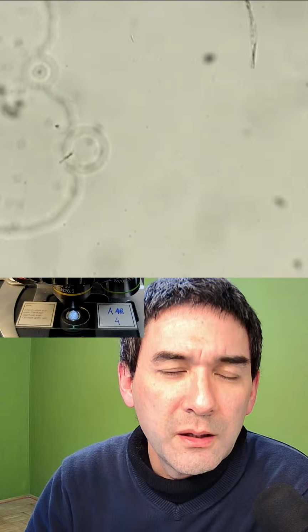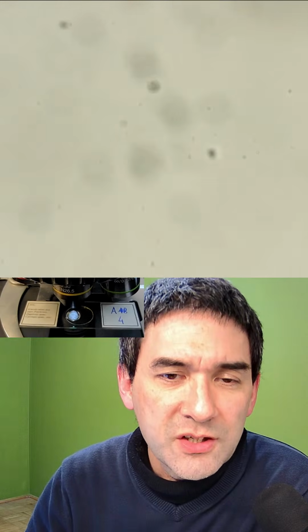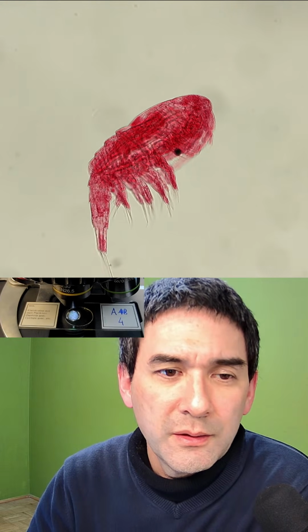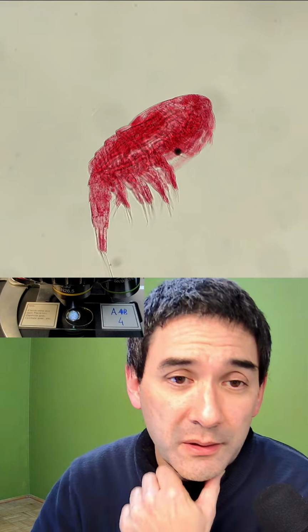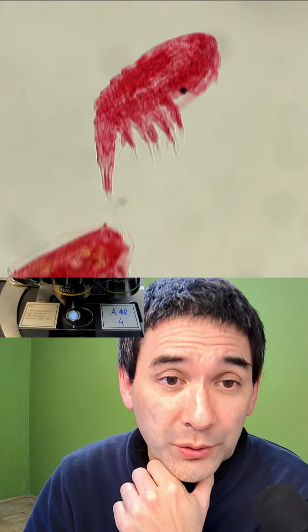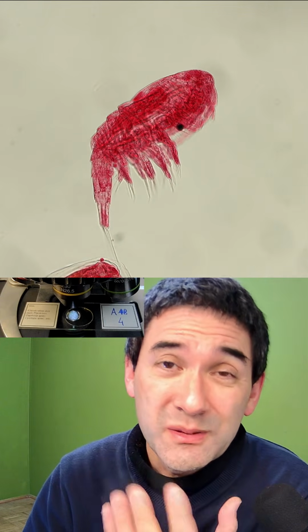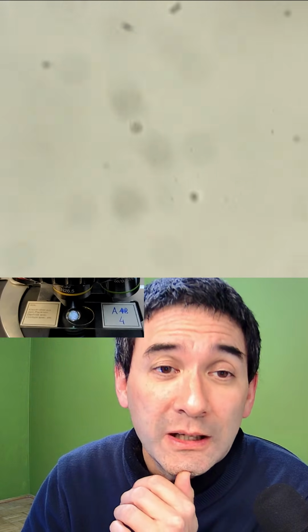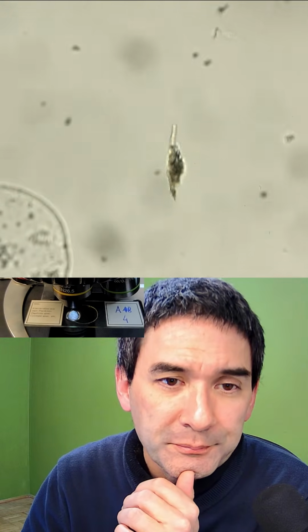It's a permanent slide. They have an exoskeleton, of course. This basically means that they maintain their shape when you make a permanent mount. Normally, delicate water organisms like algae you want to mount in so-called glycerin gelatin, a mounting medium which does not completely dry out. But this one over here is completely dried out.